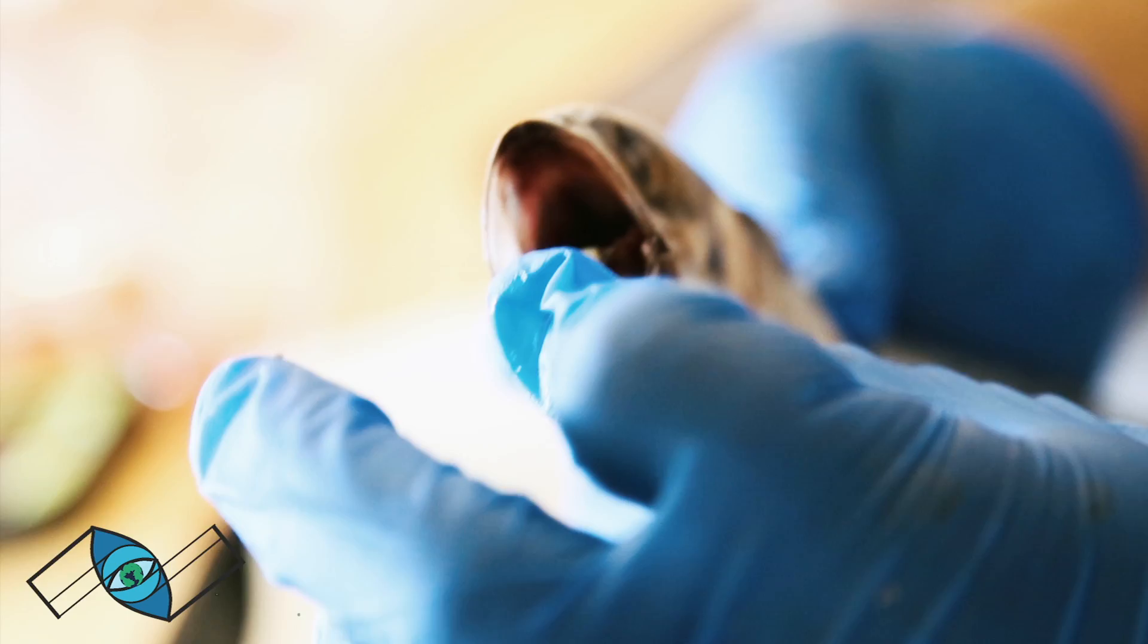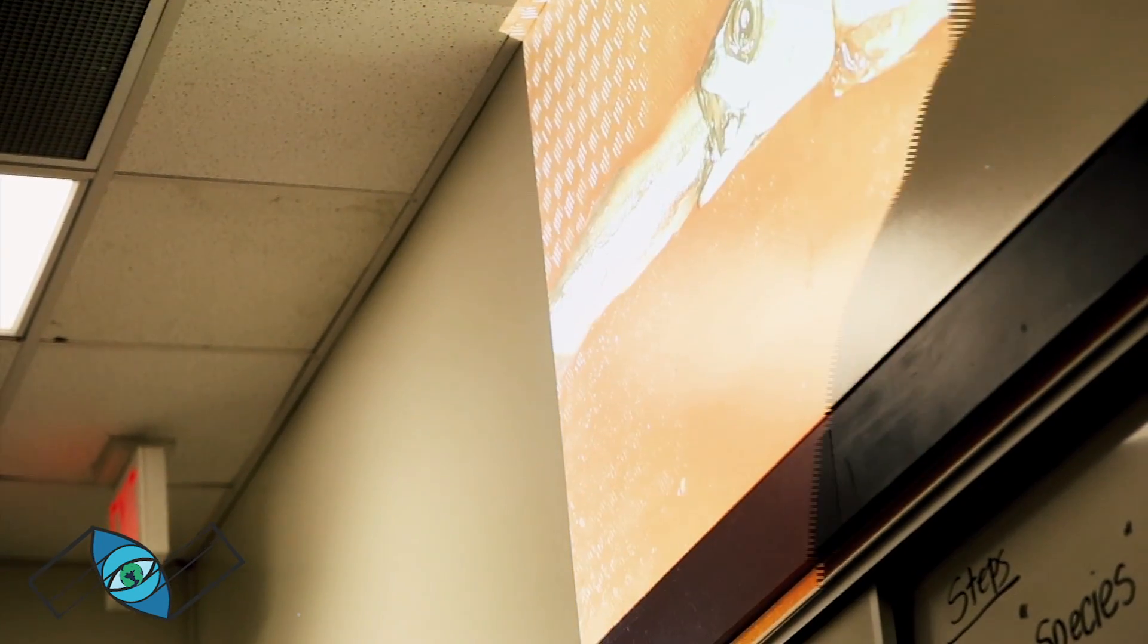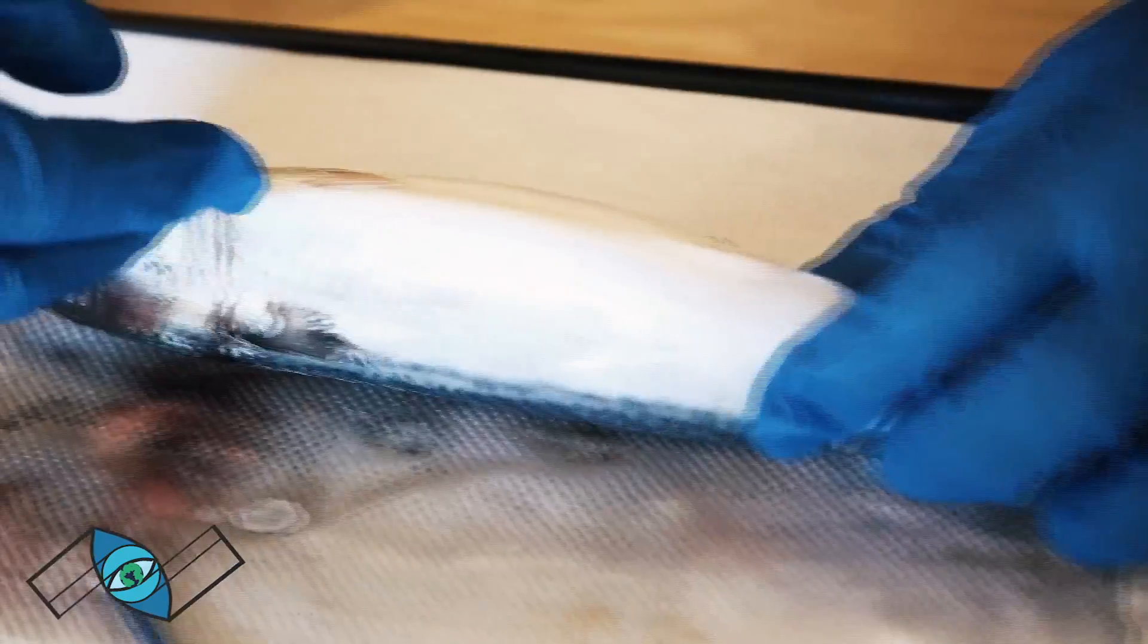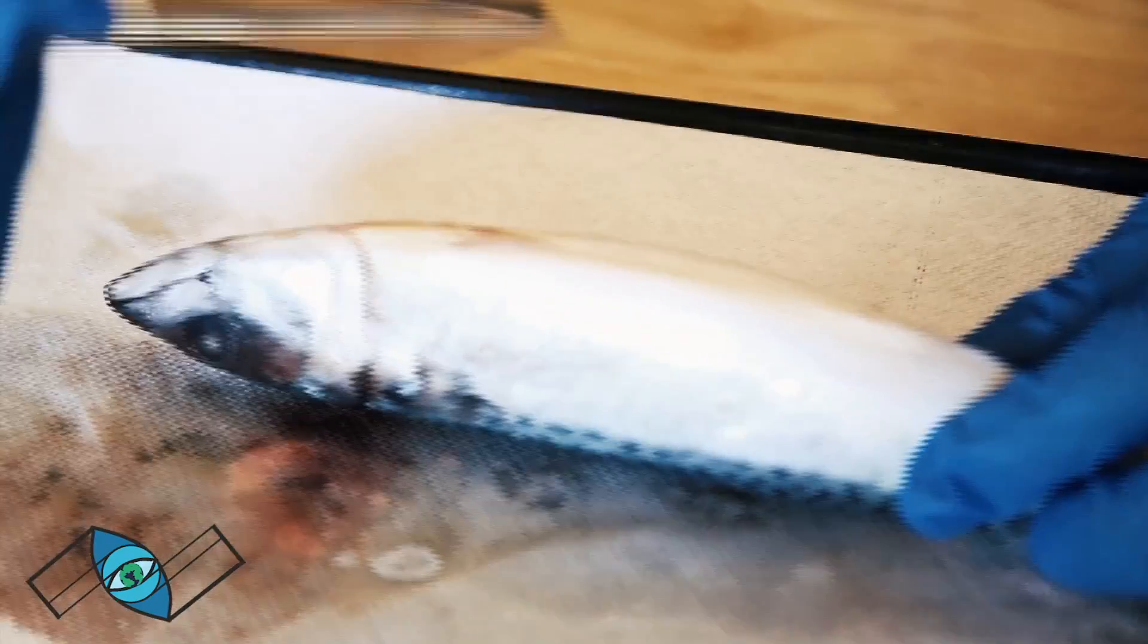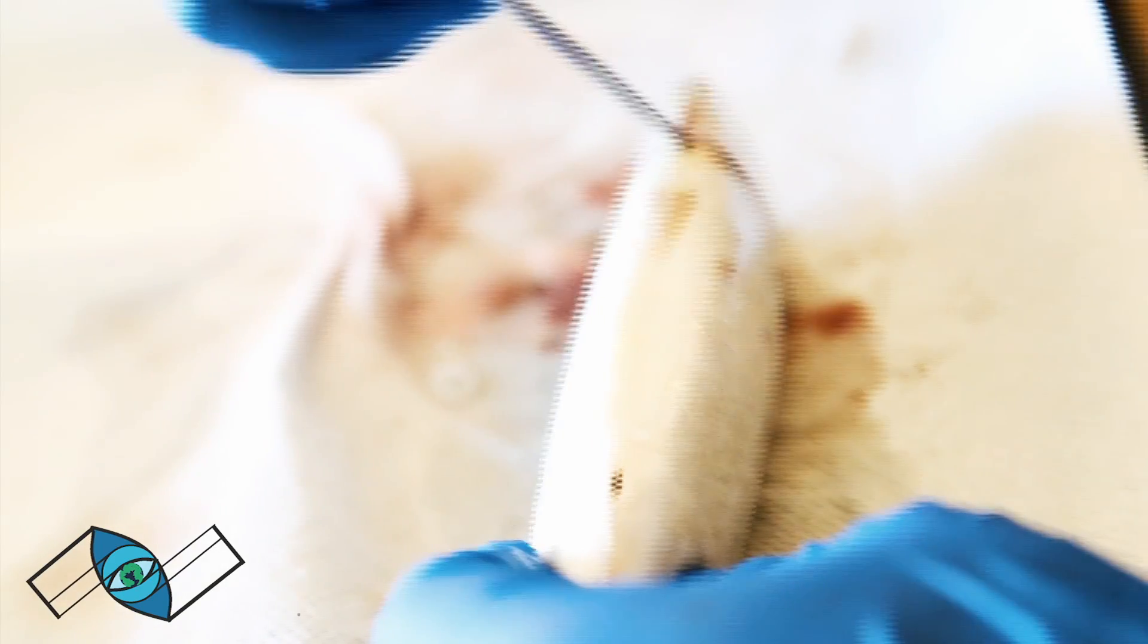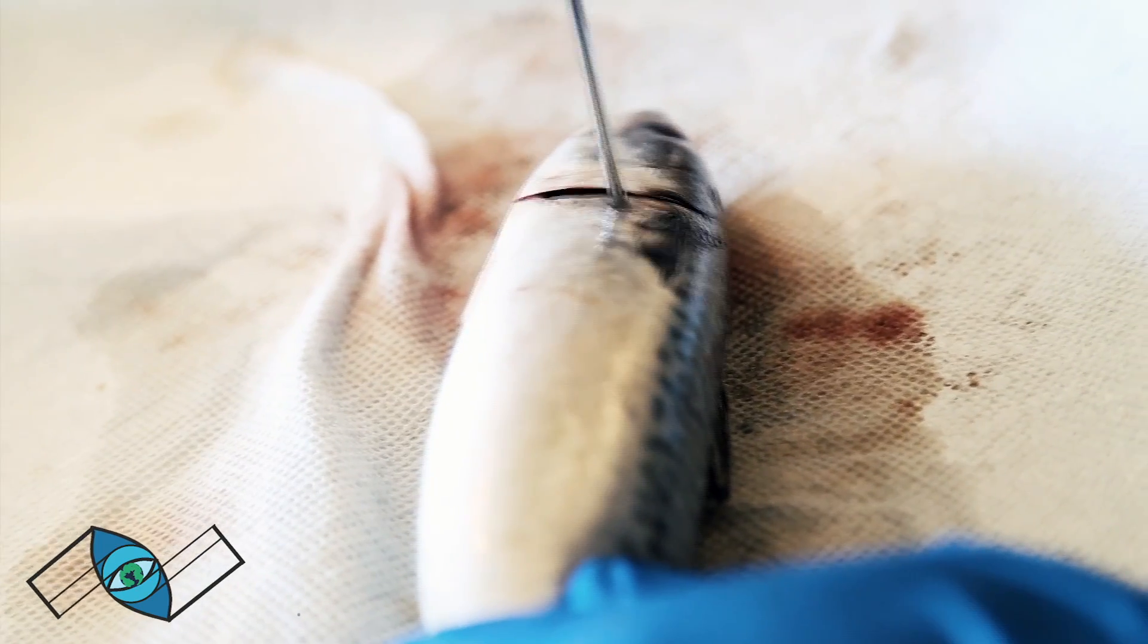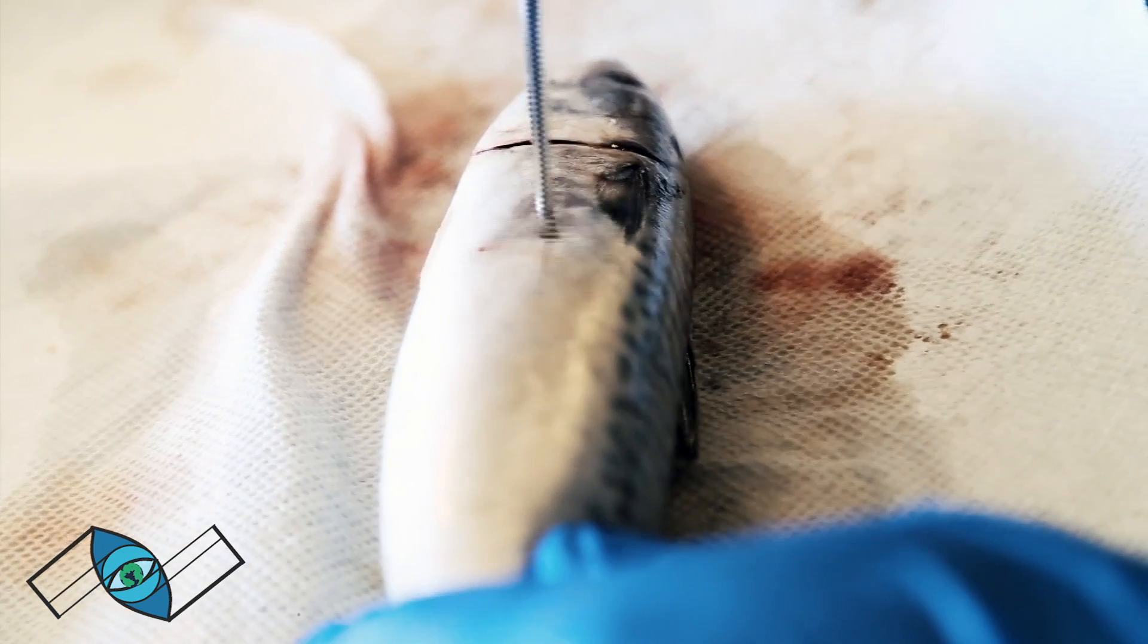When we dissect fish, we're going to start by taking a look at the ventral side to get rid of the guts. You want to cut through this bone. There's actually a hard bone here that the fins connect to, so you can see then here it's all soft structures. That's where the muscle is, and then there's bone.